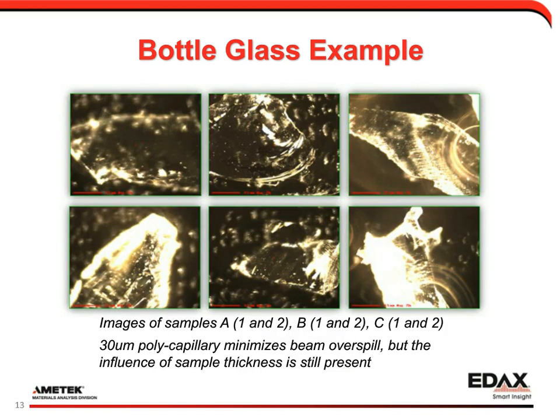And this slide is just to give us a visual. We have sample A fragment 1 and A fragment 2 in the first column, and then fragments B1 and B2 and C1 and C2. Basically, the point here is that while the samples were not microscopically small, we could still handle them with tweezers, and they were still visible with the eye.